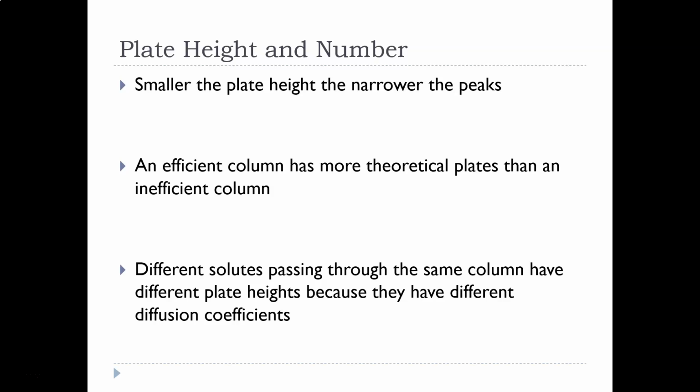So we keep track of the number of plates to tell if our column is going bad. Do we need to throw away our column and buy another one? Or does this column not work for this compound? So it's kind of a maintenance sort of situation.